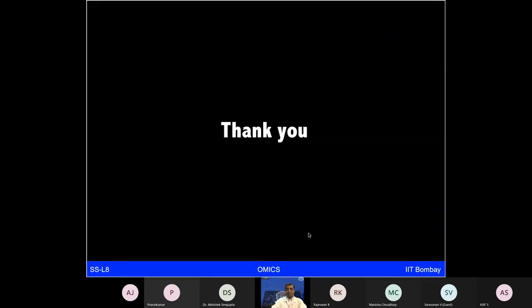I hope I have not intimidated you that these are very complex technologies. At least I hope I have given you some flavor, some excitement, that the basic chromatography, basic electrophoresis, along with some of the newer additional high throughput approaches like microarrays and mass spectrometry can make you really a good arsenal, various tools which you can utilize to combat different types of infectious disease or different types of metabolic disorders like cancer, and try to provide at least some better understanding or better solution to fight against these real, sometimes invisible enemies, and sometimes the visible tumor growth which you can see.